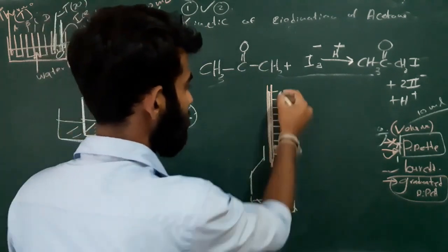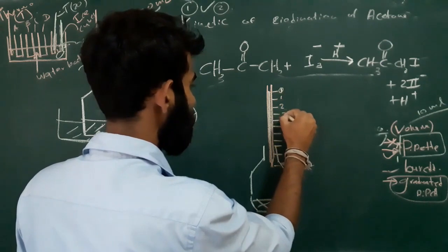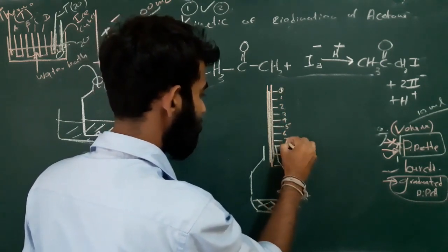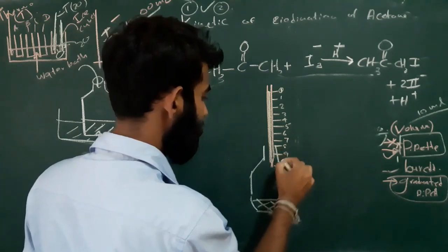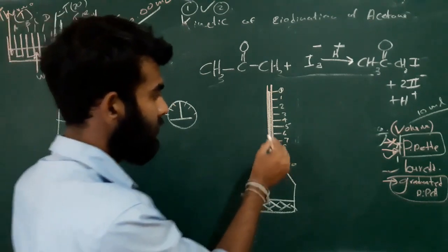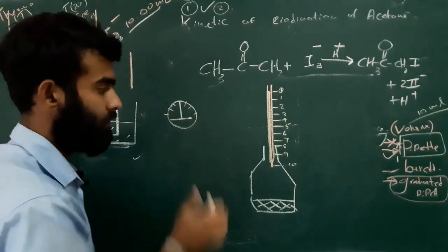Okay, here 1, 2, 3, 4, 5, 6, 7, 8, 9 and this may be 10. However, this is 10 ml. When should we start the stopwatch?